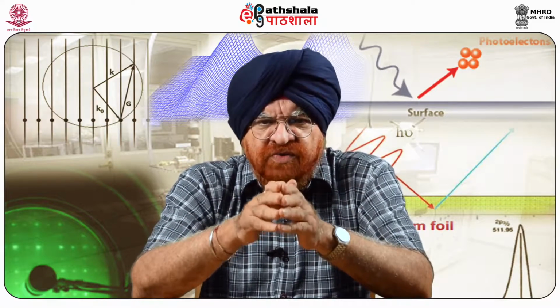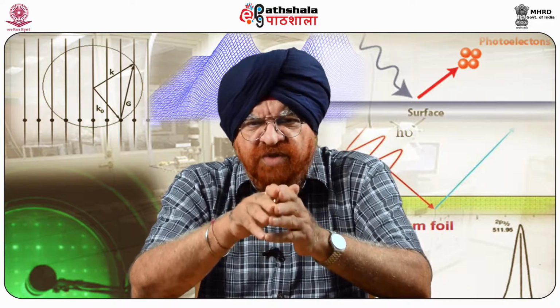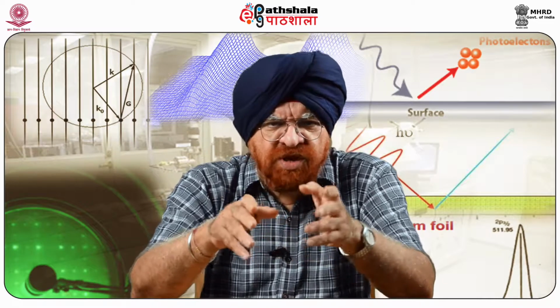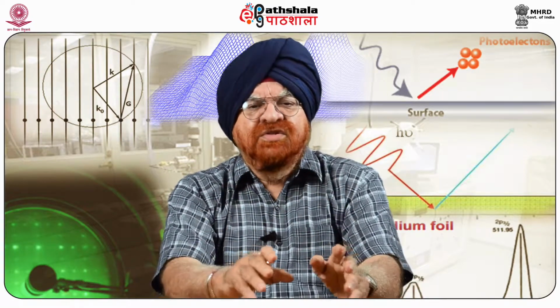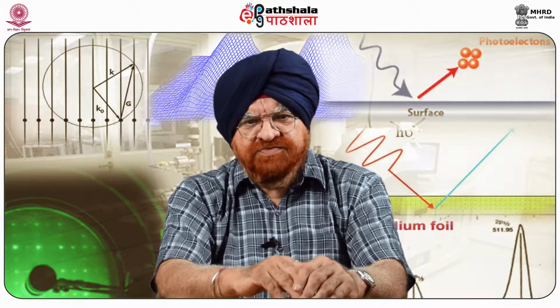Conductive atomic force microscopy is a powerful tool, first developed in 1993 to study the local tunneling currents through 12 nanometers thick silicon dioxide films.